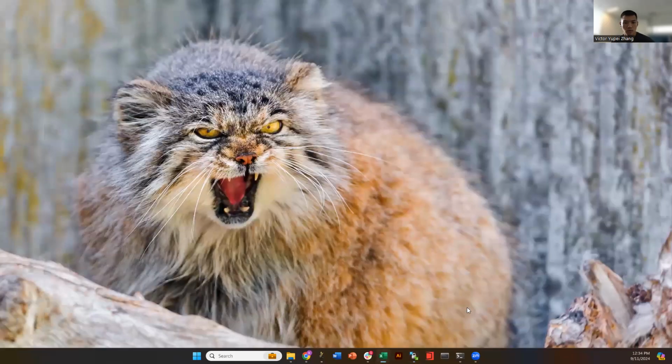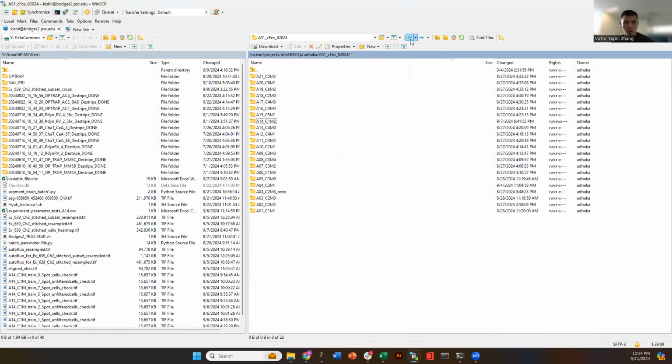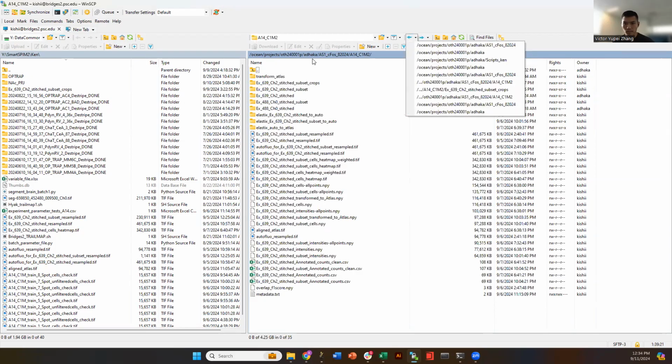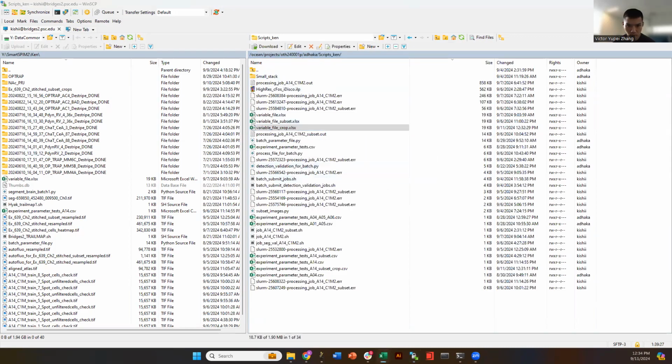This is a common thing between elastic and spot detection. The way the pipeline is constructed is that it will first pass a lot of candidates, and it will further threshold them based on different parameters that you gave, right? Those parameters can be found in the variable file. And that's actually a very important point that I want to touch next.